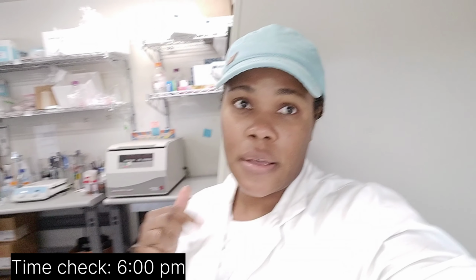It's 5:57. I came in at 7:30 a.m. Finally done. Well, for the in-lab portion. And then tomorrow I'm going to call it a short day, but in the coming days I'll do the count of the spores to see the influence of the light condition and the nutrition on the number of spores produced by the 3 fungal isolates.